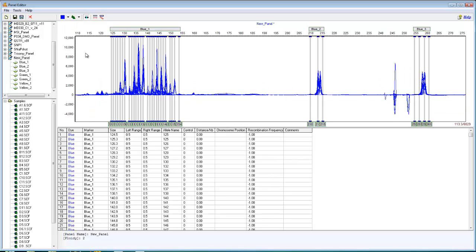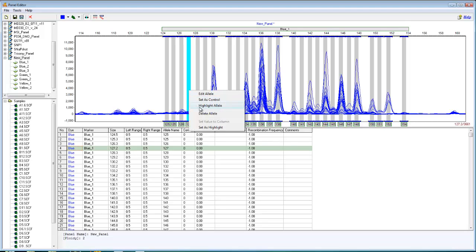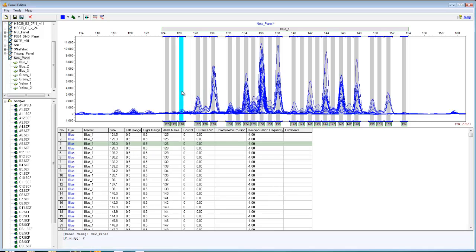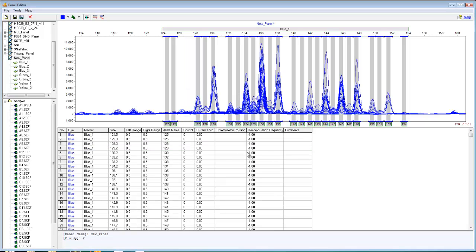And now we can see that the program has automatically added markers and alleles to each major peak cluster. With automatic panel creation and manual panel creation, it's always a good idea to go back into each specific marker and edit out alleles that you don't want, and edit in specific alleles that you do want.